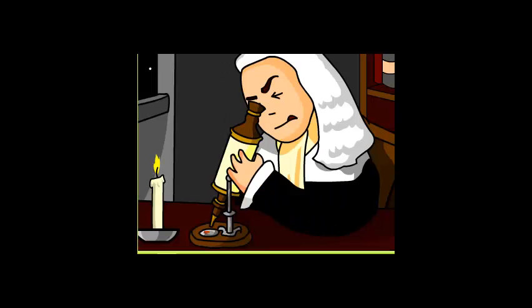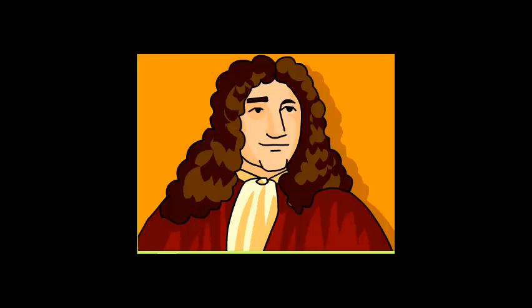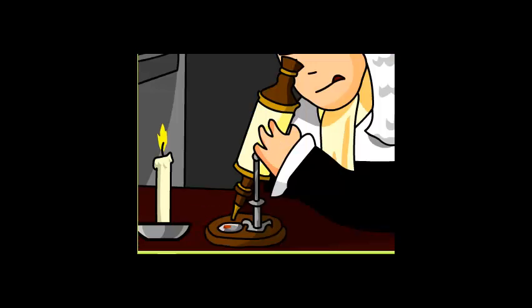The optical microscopes we use today follow the same basic design of the first compound microscopes, invented sometime around 1600 in the Netherlands. An inventor named Anton van Leeuwenhoek made the best microscopes in those early days, so he's known as the father of microscopy. But lots of inventors were building similar instruments around the same time, so it's not clear who made the very first one.